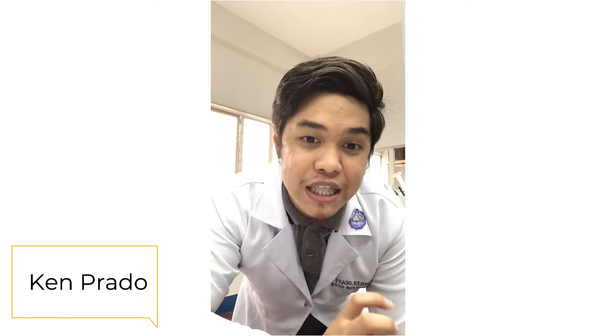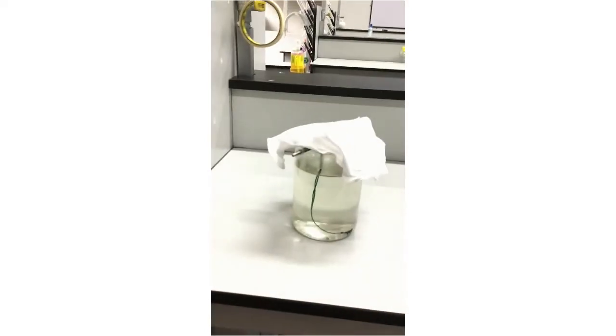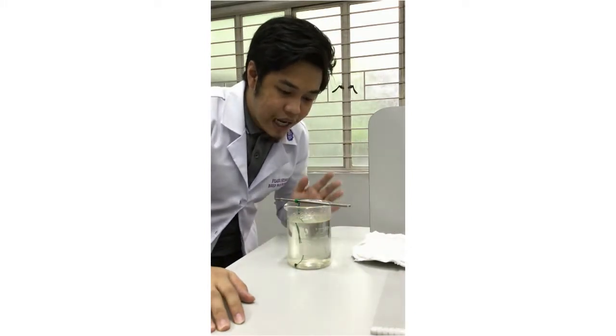Alright, we are back here with our experiment. Right now it's almost 2 hours since we set aside our experiment. Let's check it now. This is the update for our experimentation on the formation of crystals. I can observe that there are already crystal formations — I want you to see it.